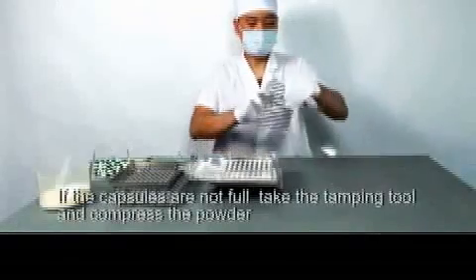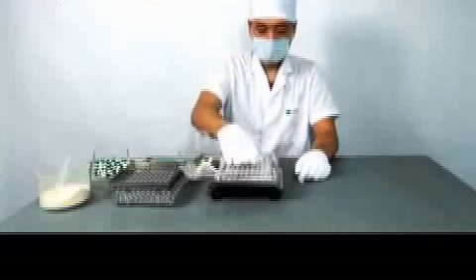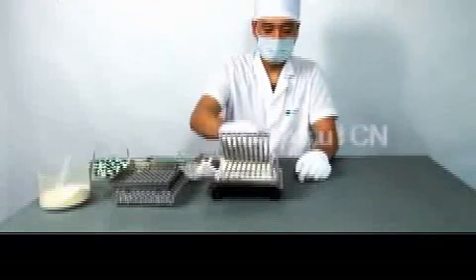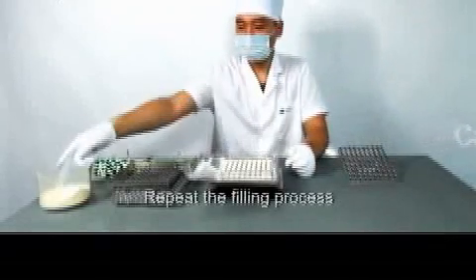If the capsules are not full, take the tamping tool and compress the powder. Repeat the filling process.